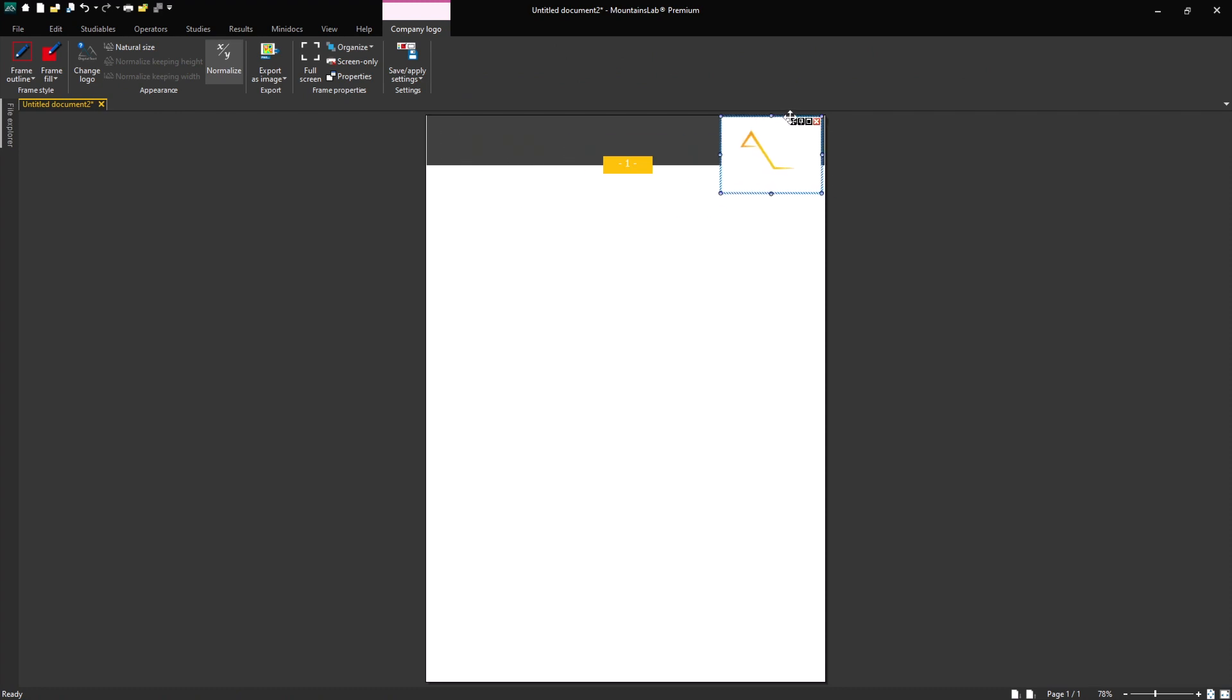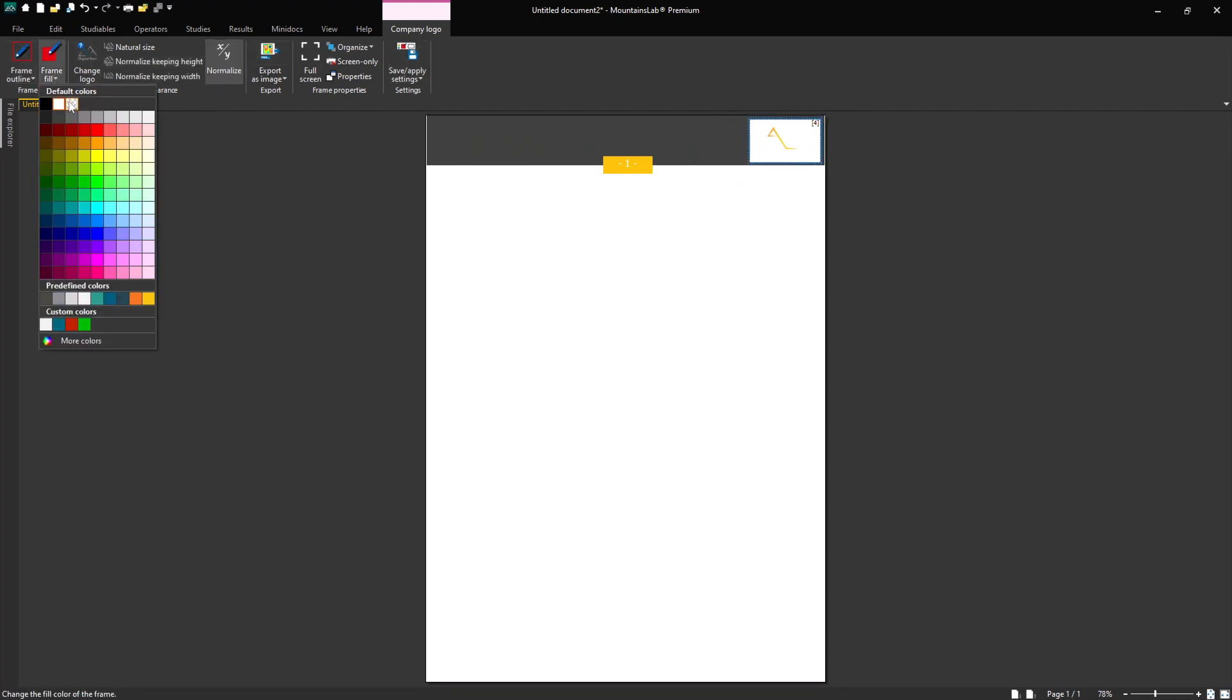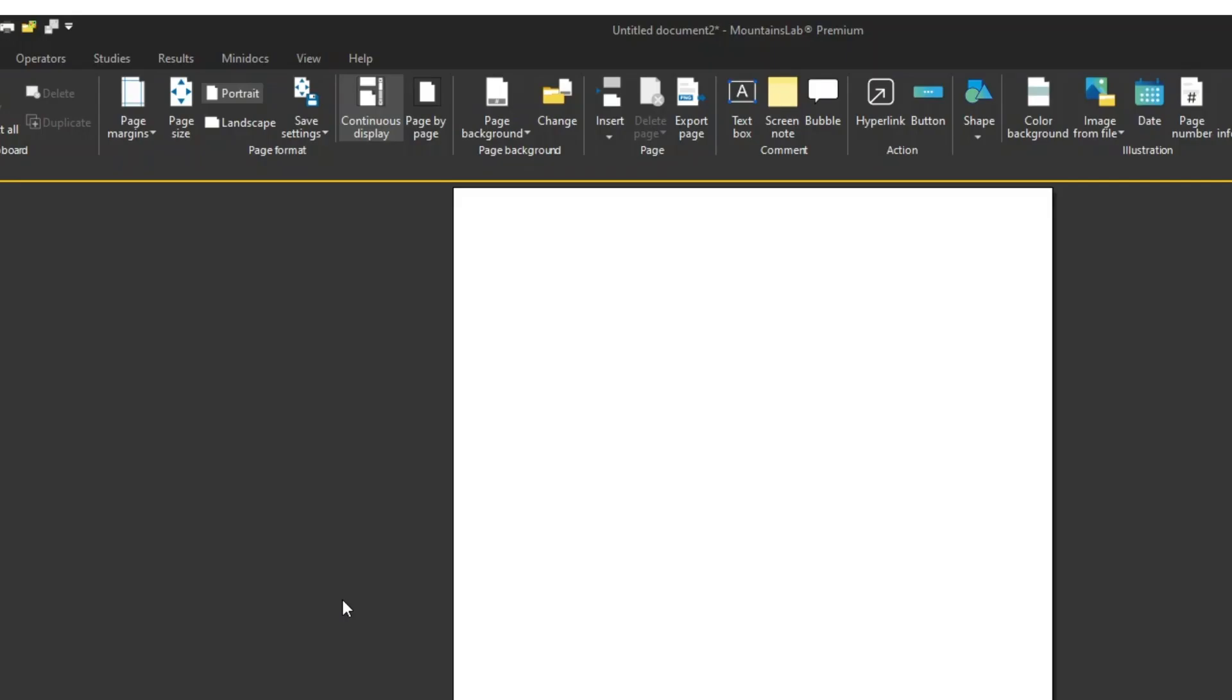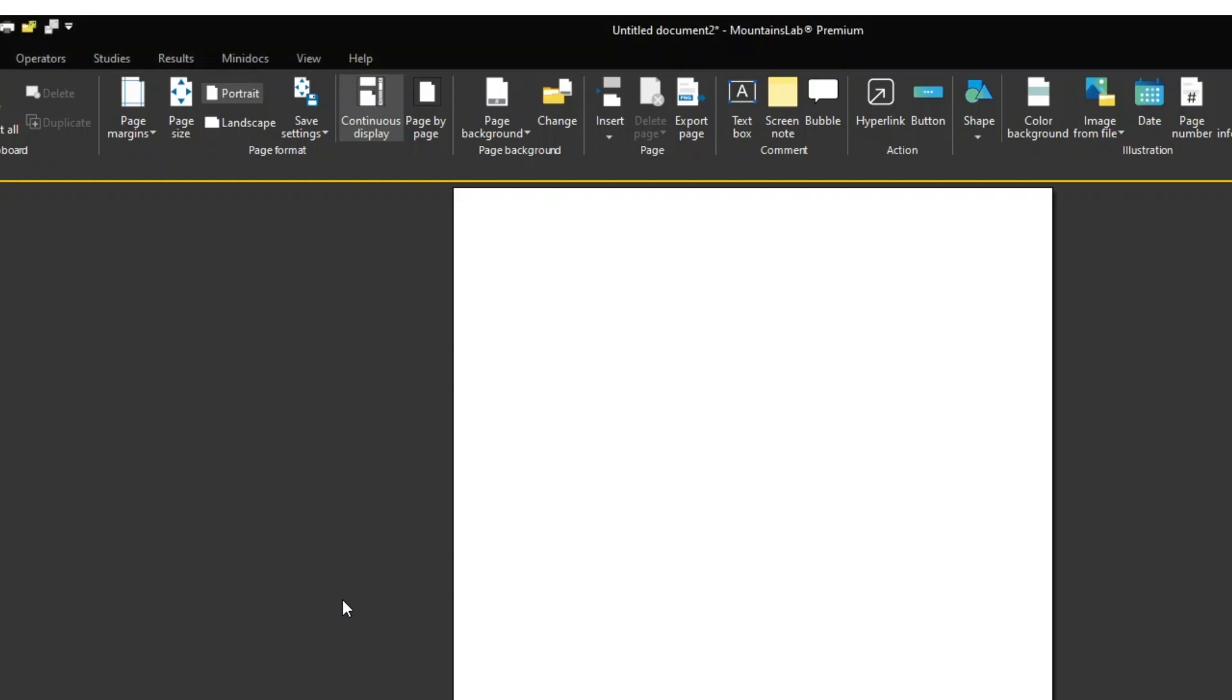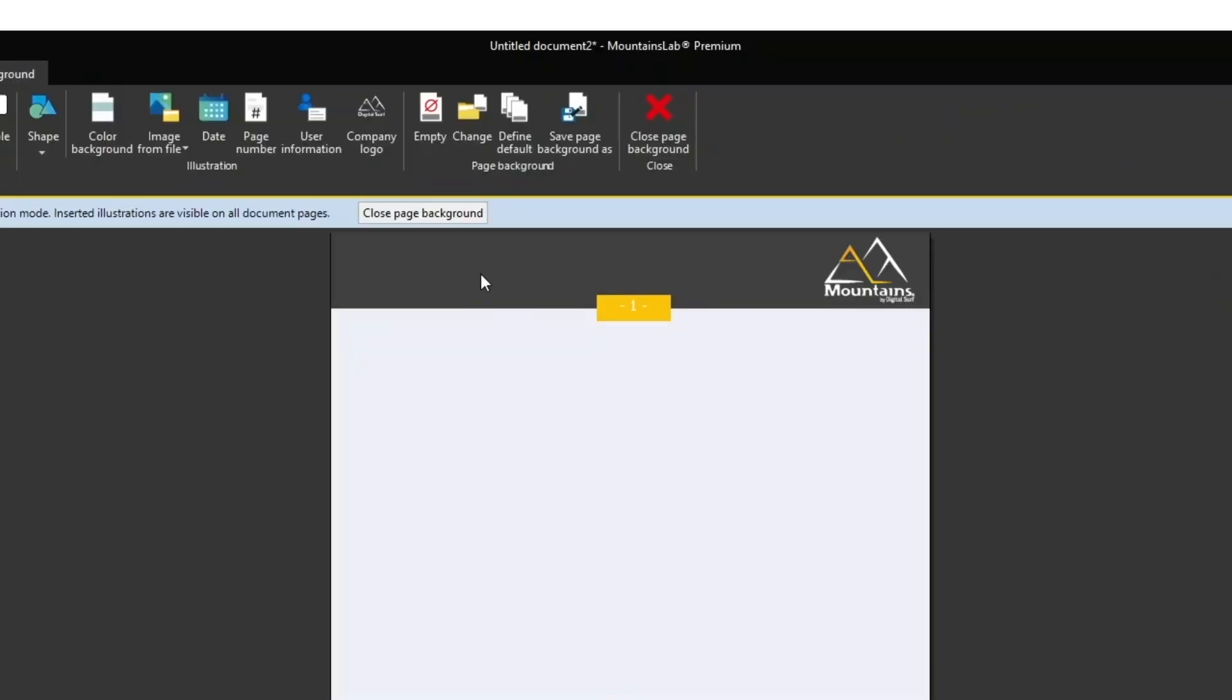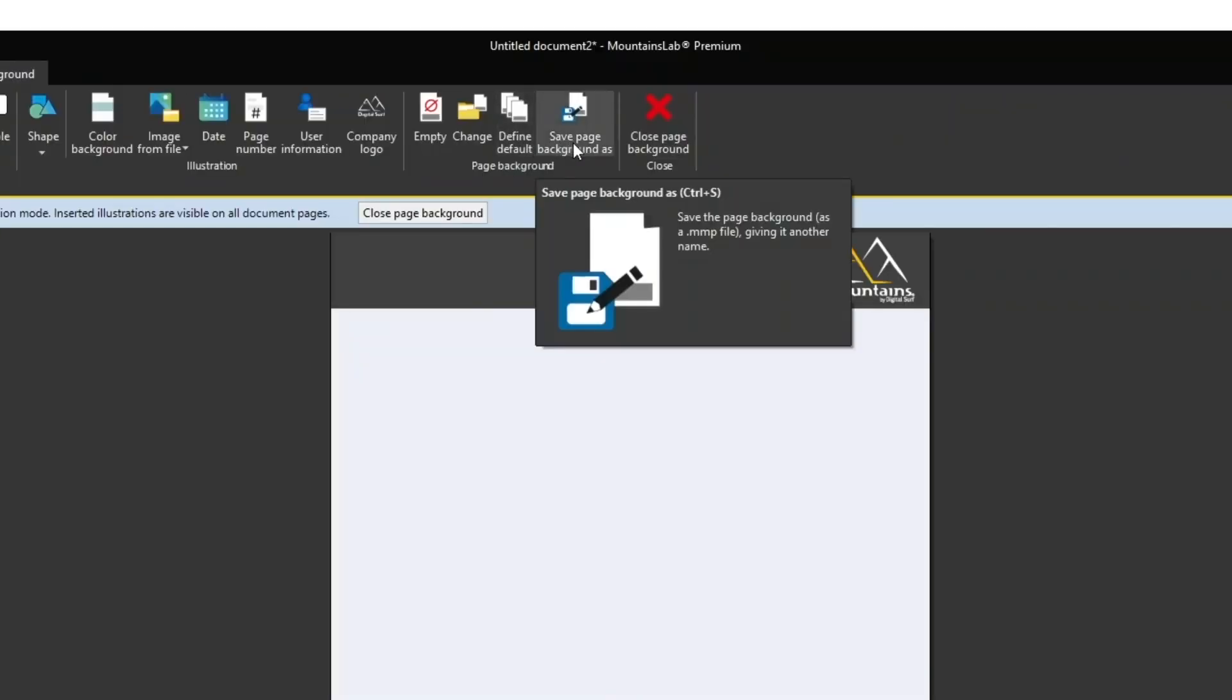I can also insert my company logo. If these elements should appear on all pages of your document, switch to Page Background and add the desired elements. You can save page backgrounds as files and reuse them on other documents.